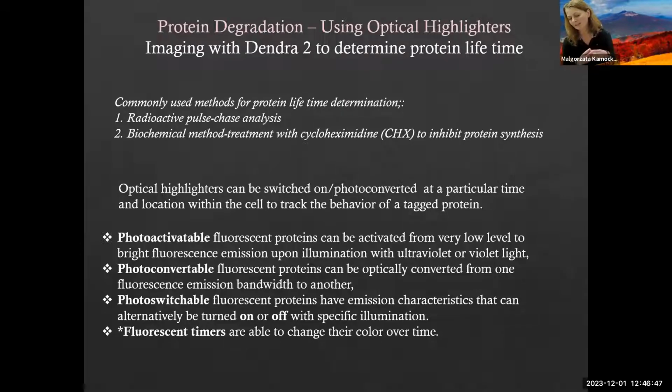So it can be just income of new protein to the region of interest, not necessarily indicating a synthesis of a new protein. So those techniques were not great, but optical highlighters come very handy here. And with Dr. Vascotto, I used Dendra-2 to determine lifetime of endonuclease.